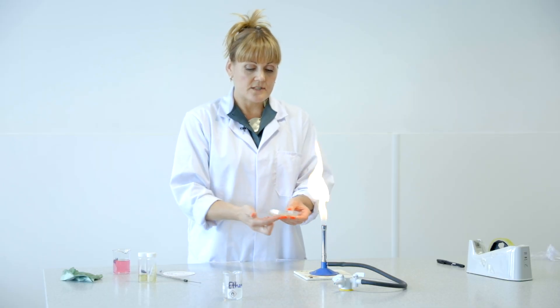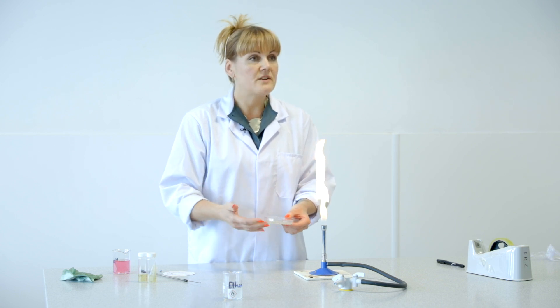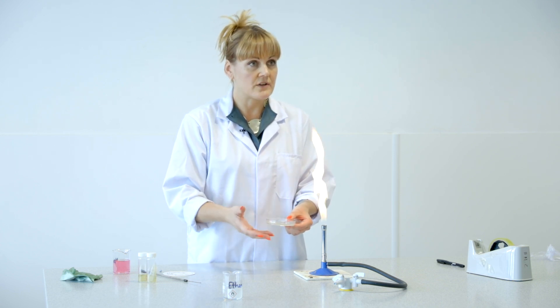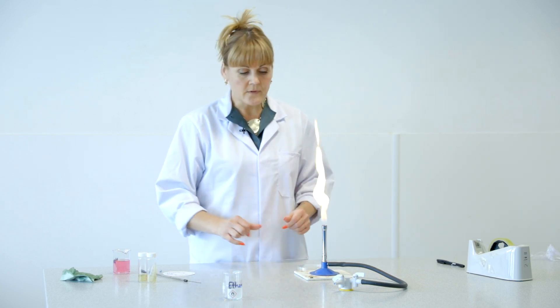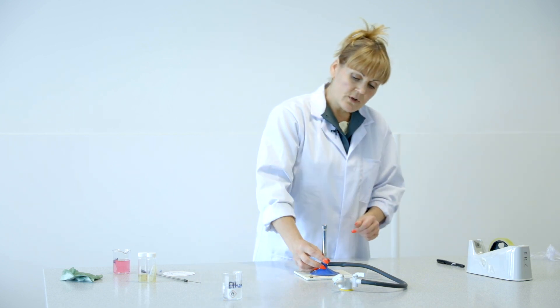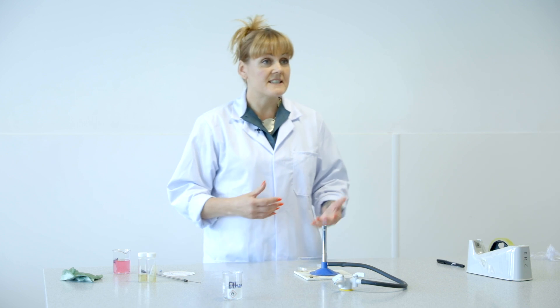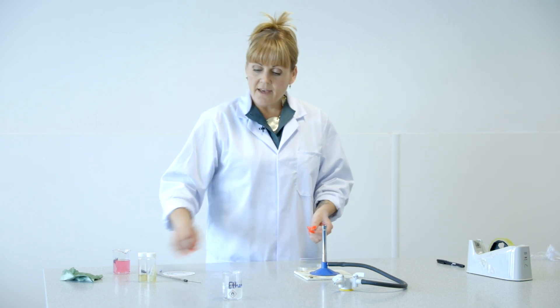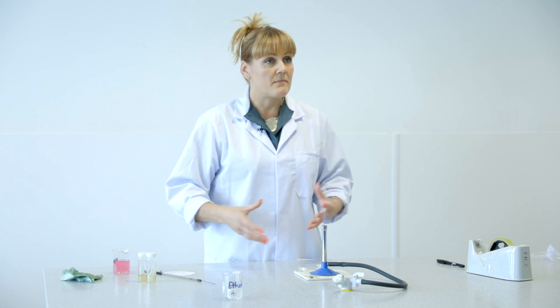This already has nutrient agar solidified in the bottom, which provides all the nutrients for the bacteria or fungi that you're going to be culturing. I'm going to place this right here. Now I'm going to open it and let the oxygen in, so it is the blue flame. The blue flame is what you use when you are flaming any of your equipment.